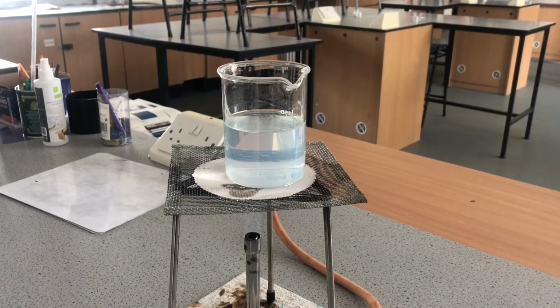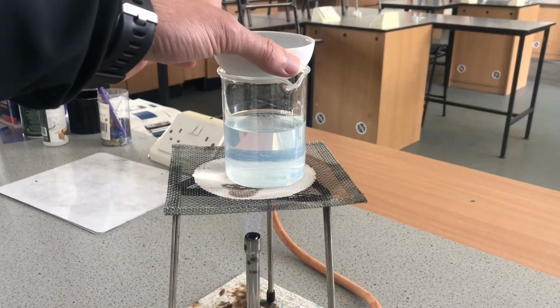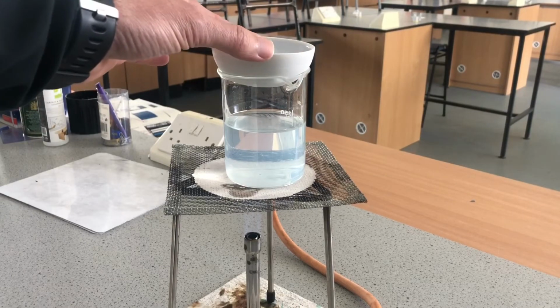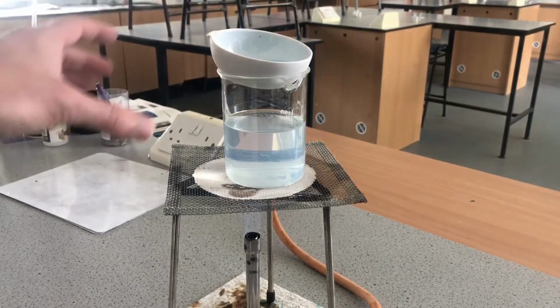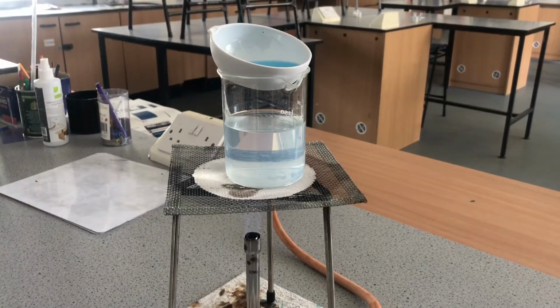So I've got my water bath here. It's just a beaker of water on top of a Bunsen burner which we're heating up, and on top of that I'm going to put the evaporating basin with the copper sulfate. If I tilt that slightly, you might just be able to see the blue solution in there. So that's going to heat now, and the water in there will evaporate. It'll take some time, and maybe in about half an hour or so we'll have some crystals, so we'll pause the video and come back to it then.